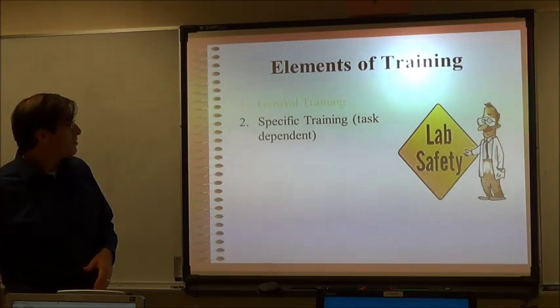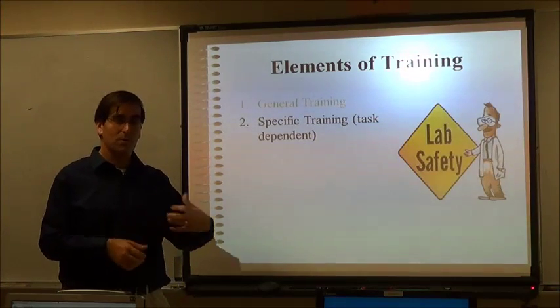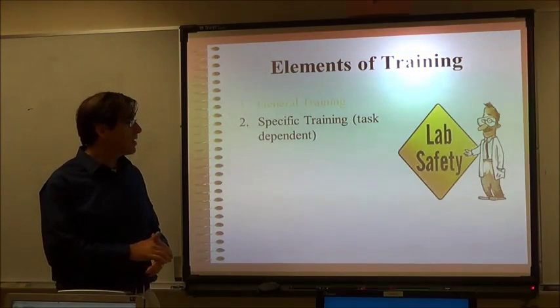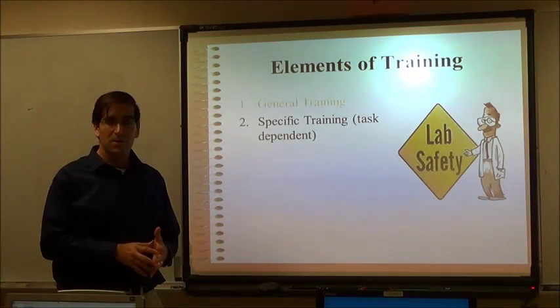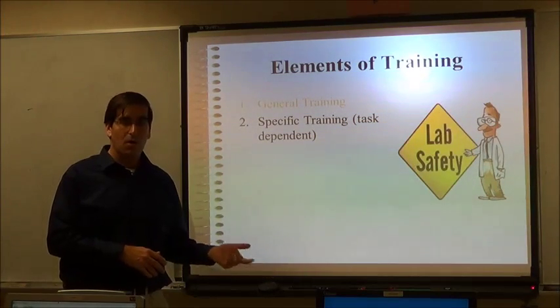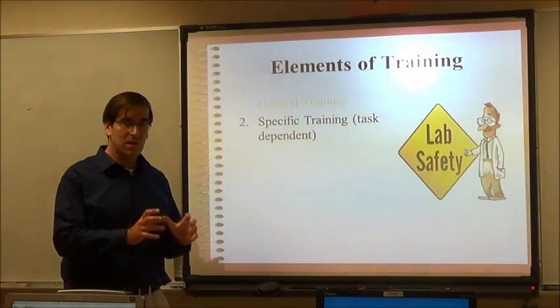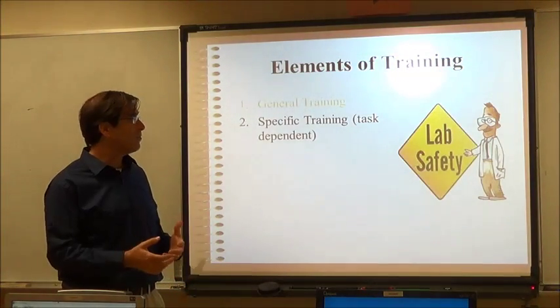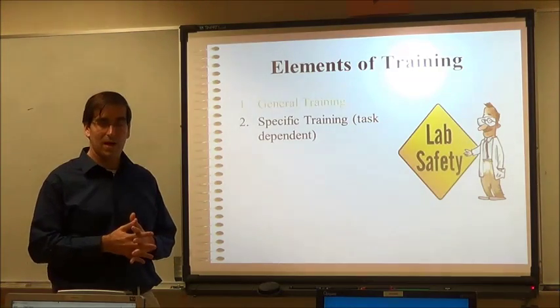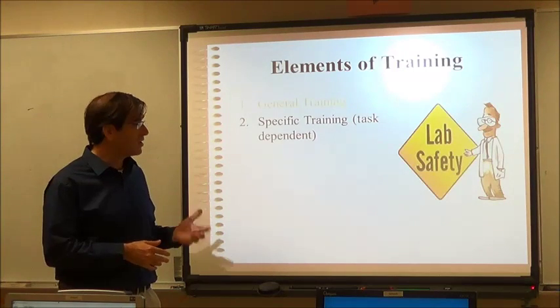Now that brings me to the specific training. This is something that would be important for you in your particular position. This is not something that I will be going into detail of in this talk. Specific training would be something that if you have a particular piece of equipment or you do a particular type of experiment that's very unique to your area, that's the one that you would then come to me, ask me if you want to create, say, new safety protocols, or to go over what the training would be for that.